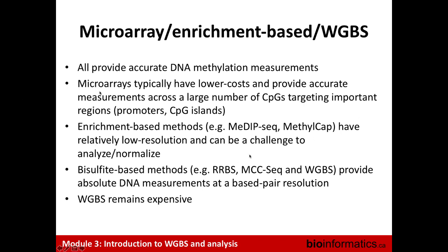The enrichment-based approaches are a little harder because these are mixtures of cells and you're doing an enrichment. We'll see later that SNPs and variants lead to all sorts of differences in these regions, and all of these are combined into just a number of reads from that region, which makes the data more challenging to analyze and normalize. Microarrays, like what we talked about, are lower cost but provide accurate measurements, especially if you know what you're looking at. I don't have the example of whether you do have a microarray or not on the slide, but I think that was a good point as well.